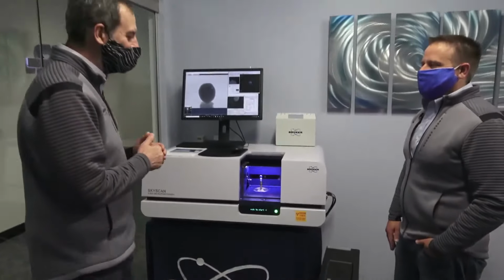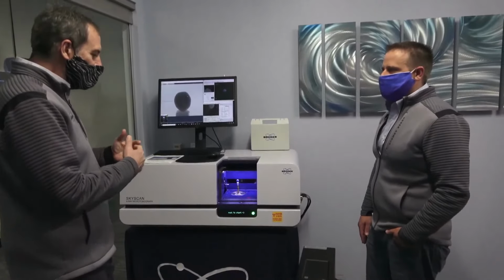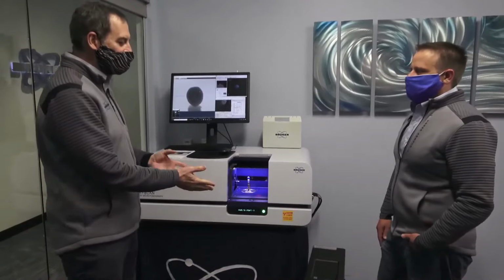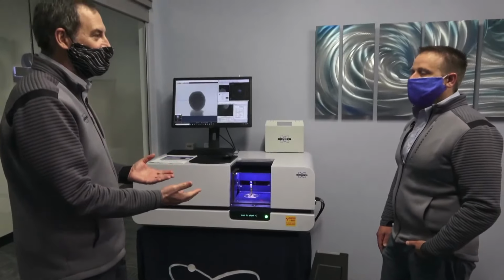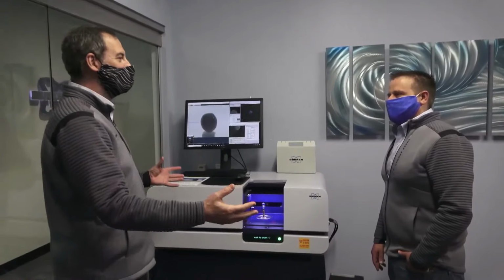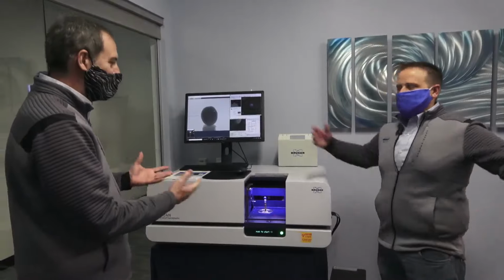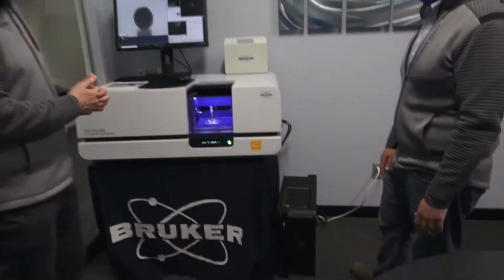Absolutely. That is one thing about X-ray tomography, X-ray microscopy: one of the things that's brought it to the consumer in the last 10 years is the advent of high-end graphical processors that you and me can actually use. So this has a pretty high-end GPU. Actually, 20 years ago, you needed a large computer, tens of thousands of dollars just in the computer. Yeah, it might be as big as this room. Exactly. That's an amazing device.